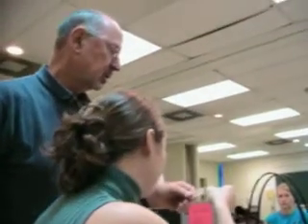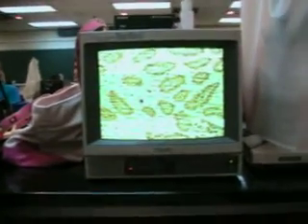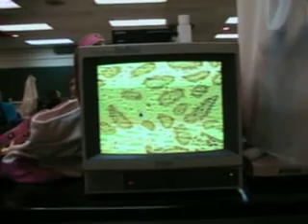And there are a number of Paneth cells. All those very dark red granulated cells are going to be Paneth cells. But the mounting medium is so dried out that I just cannot really get good focus here. Do you have an 88? Oh, it's bad. And all these are the large villi in cross section. Nobody has a good 88. We have one good 88. Okay, then let's share it with the rest of the class.